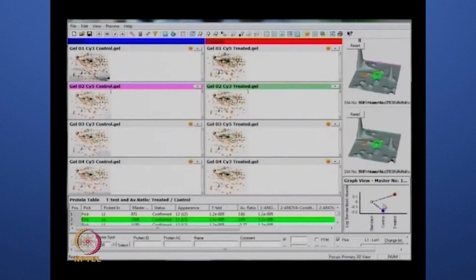These are all the things we are able to identify very easily in BVA. This is very user friendly. There is not much manual interference. Okay, this is what helps you to analyze your dye gels.